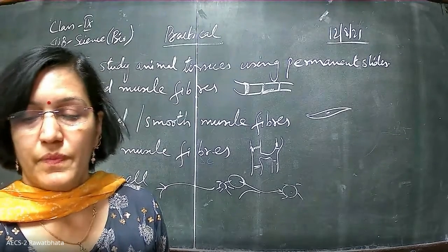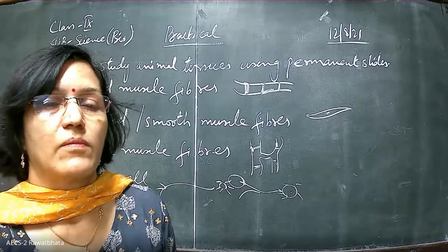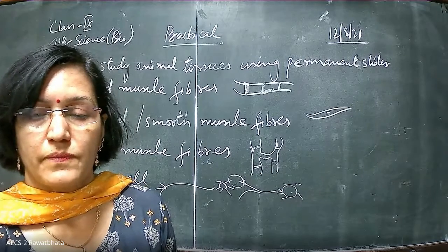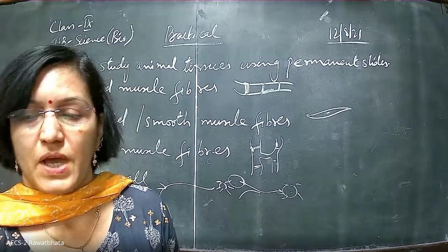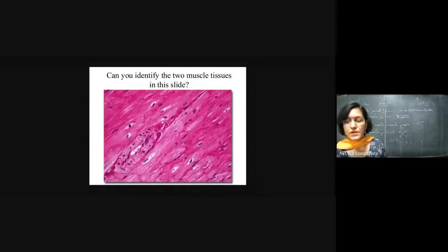And now, let's see. I'll be sharing with you smooth muscle fibers. Let's see if we can have a look at that also very clearly. This is the slide for smooth muscle fiber.